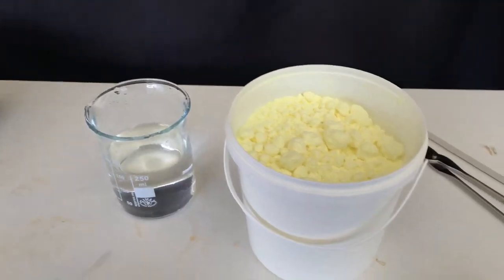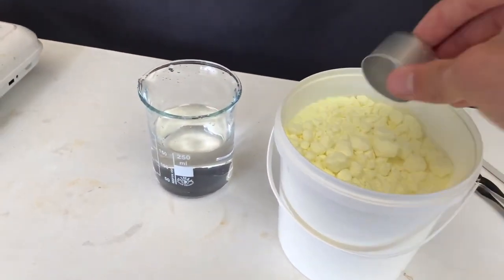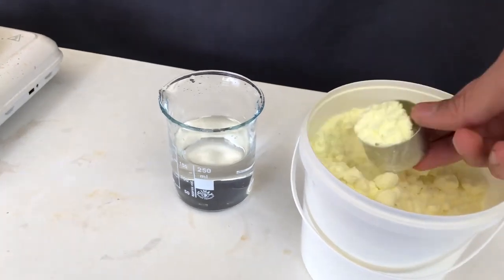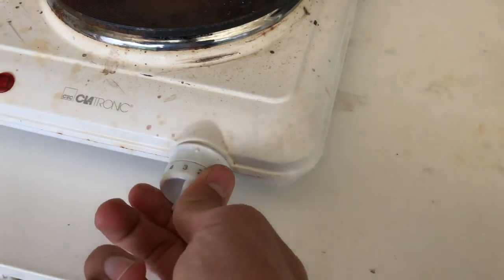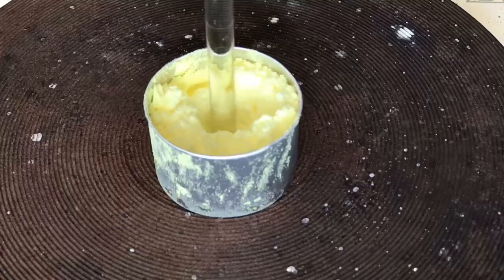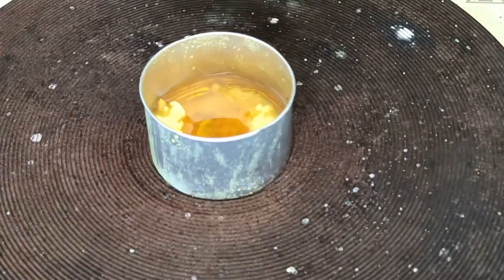We start off by filling a small aluminum dish with sulfur and afterwards putting it onto the hot plate. The hot plate is turned on and we allow the sulfur to melt slowly. We poke the sulfur profusely with a glass rod to motivate it to melt.